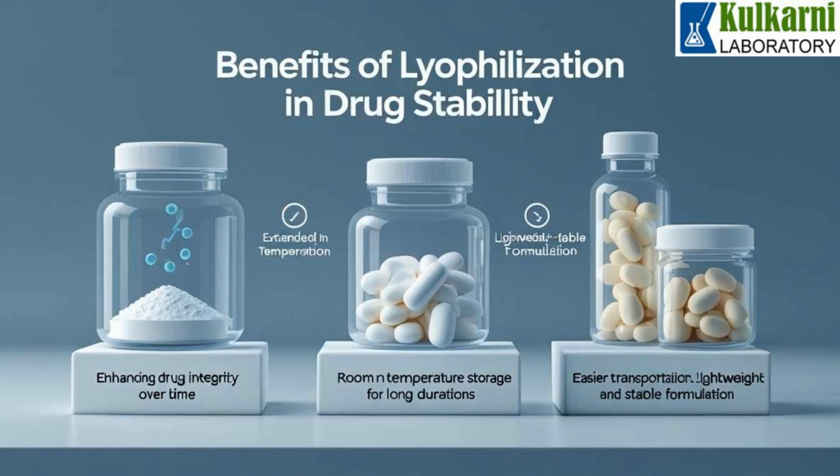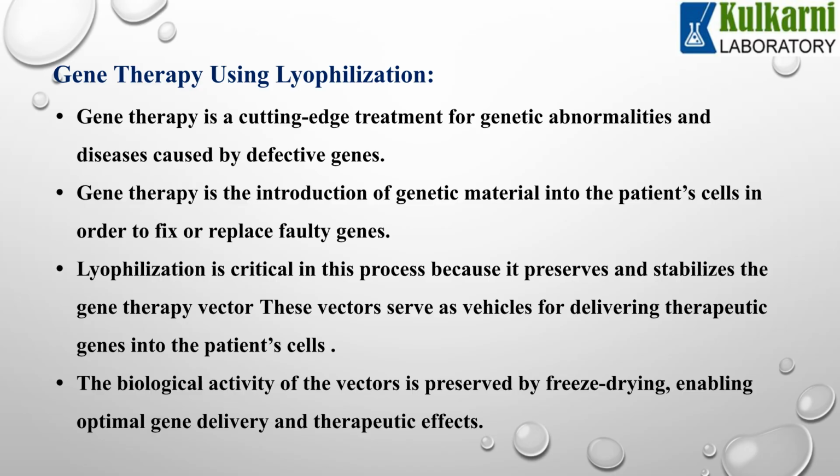Lyophilization offers significant benefits in drug stability. It enhances drug integrity over time and allows for room temperature storage for long durations. This results in an easier to transport, lightweight, and stable formulation. Lyophilization is also crucial for gene therapy, a cutting-edge treatment that introduces genetic material to fix or replace faulty genes. The process preserves and stabilizes the gene therapy vectors, ensuring their biological activity for optimal gene delivery and therapeutic effects.